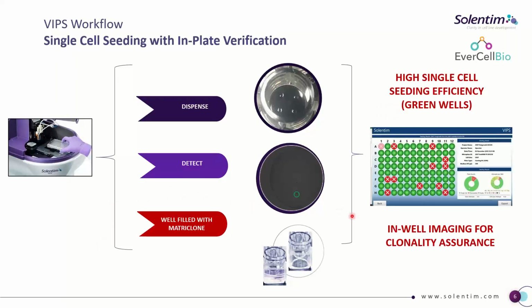So just to finish off on that, I really want to focus on the right. This is sort of showing what's happening in real time as you're seeding that plate. So just to explain the difference in this slide, a green spot is where we've got a single cell confirmed in the well immediately as we're processing the plate, and a red well with a white cross is where we've got more than one cell, so it could be a doublet or something like that. But this whole processing of this plate would take roughly 10 minutes, and depending upon the cell type, we'd get a seeding efficiency of between 70 to 90%.